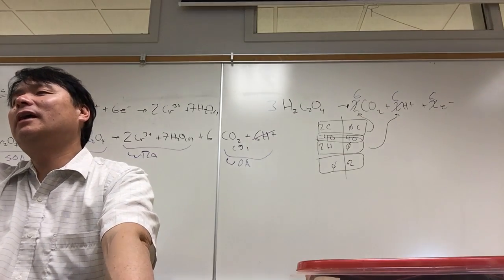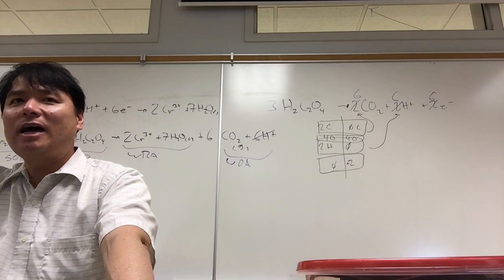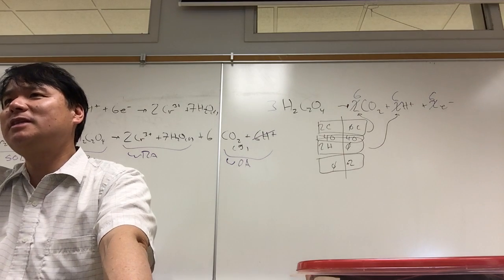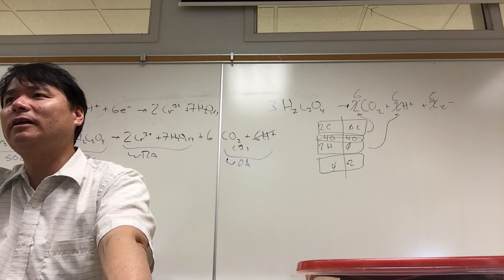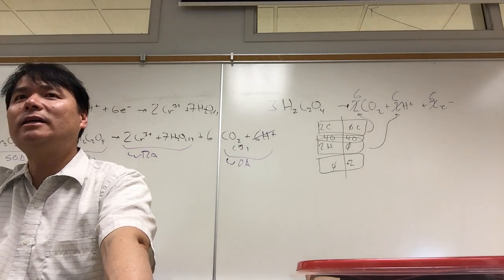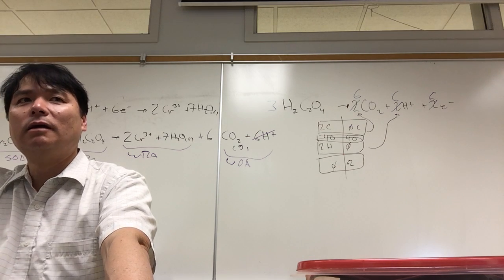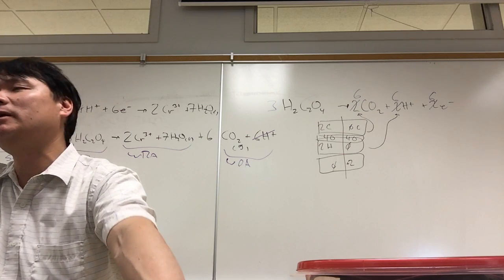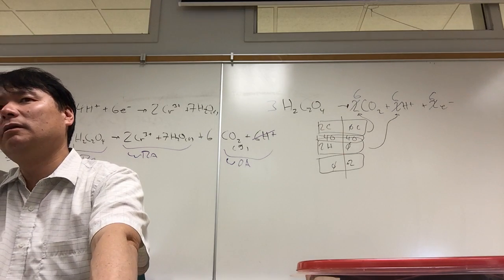I don't know if you guys did the sulfate lab. Excess barium chloride ends up contaminating your barium sulfate. How did you get rid of that? Because you added excess barium chloride because you wanted the sulfate to be the limiting reagent. So how did you get rid of the excess barium chloride?